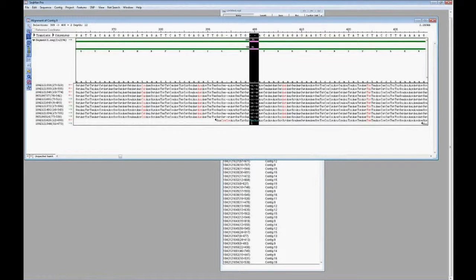And again, I have a T and a G here also causing a gap. None of the other reads show that, and those are low quality, so I could delete those. I could also trim this sequence up to a portion where the quality scores are a little higher, and then remove any residual gaps. So, depending on what the data look like, you may or may not need to do any editing, but it's certainly useful to have the capability there. And like I showed you, you can always undo changes if you have any issues.